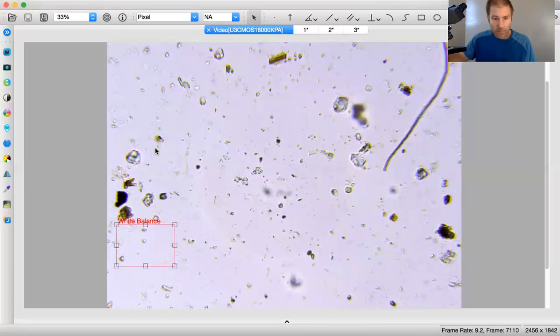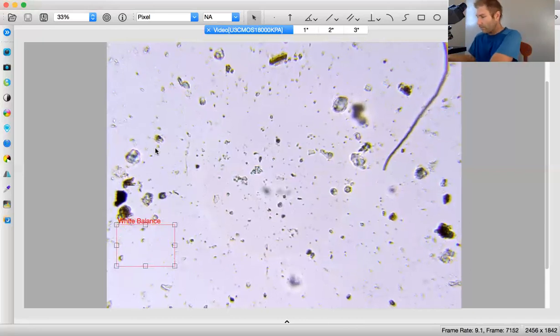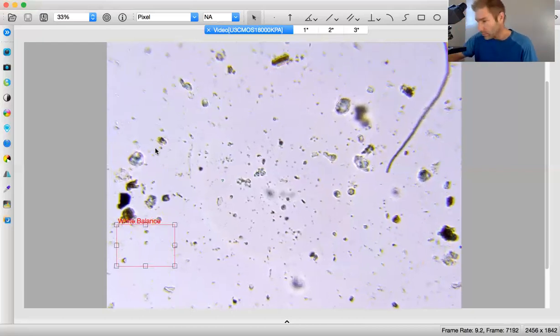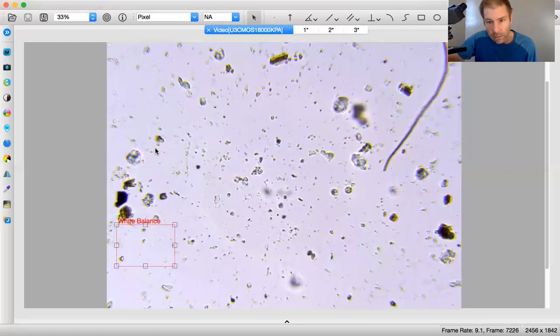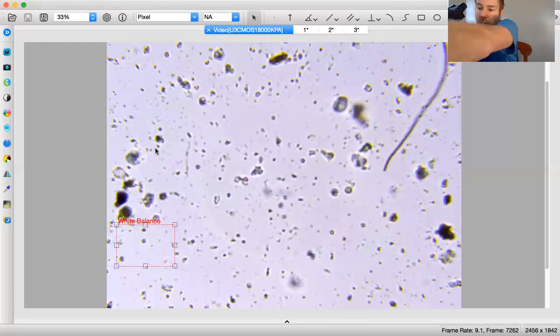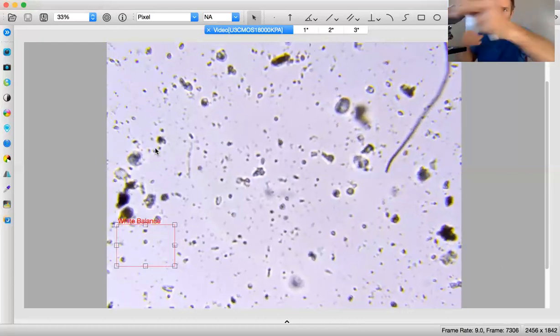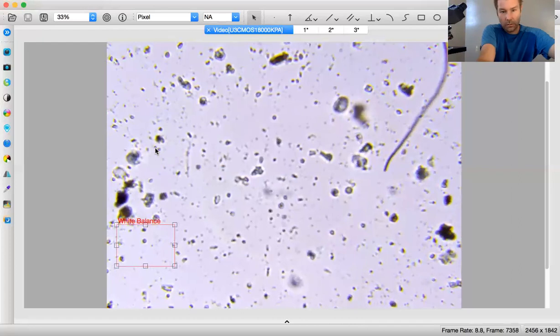I'm going to go ahead and record this first fungi. If I can find my pen here. That is, let's see, do a little measurement here. And I do have a string to help. Make sure. Yes.